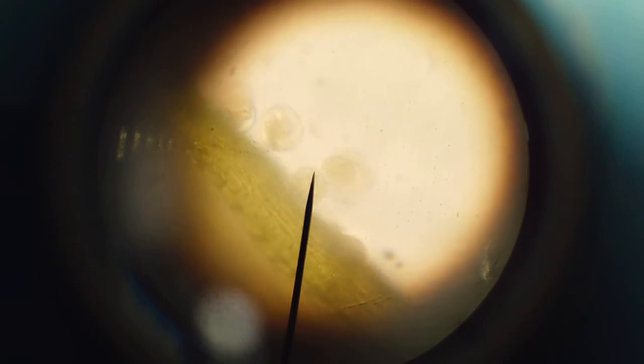These are ciliates on a stock. There's two more right here. You can see multiple layers of these guys. They live in little colonies and they often will attach to like a moss like this. And this is a moss that they're attaching. And this one up here is still moving.